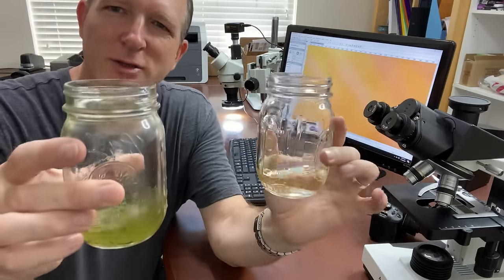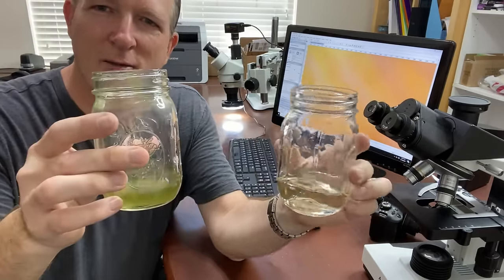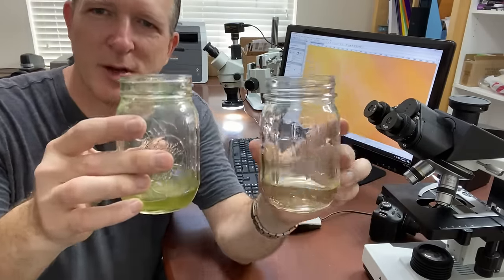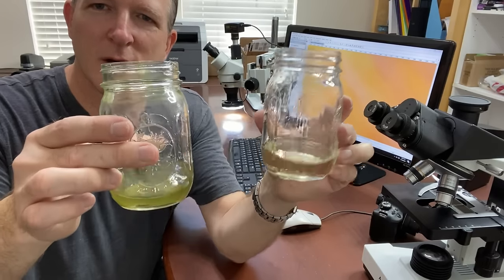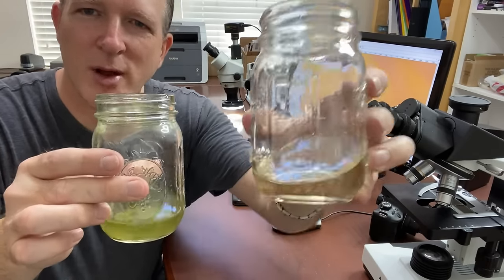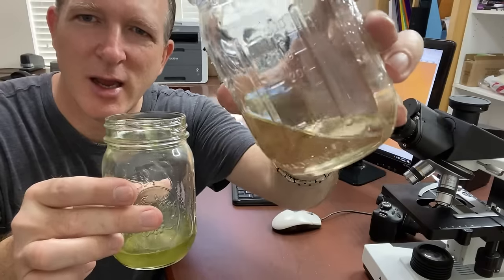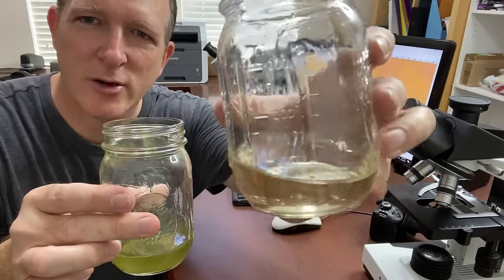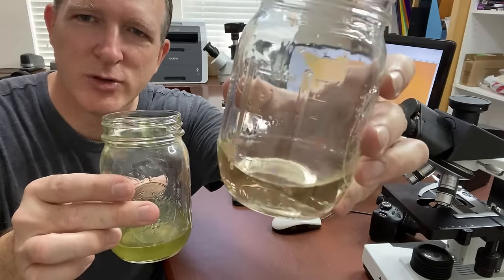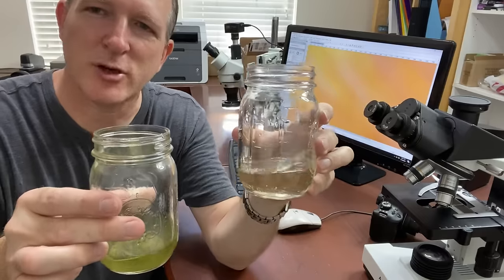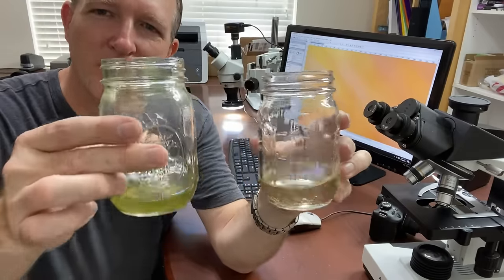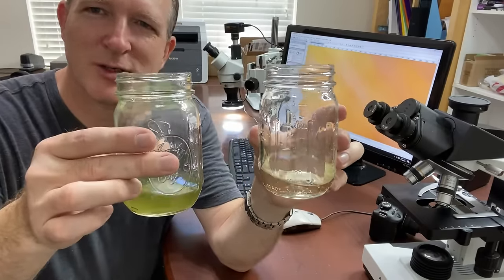All right, so here are the results and you can see that we have our filtered water here and our pond water here. Obviously a big difference, although I do see that there's still a tinge color in the water which will be interesting to see what that means under the microscope. But we'll go ahead and show both of these under the microscope and make that comparison.